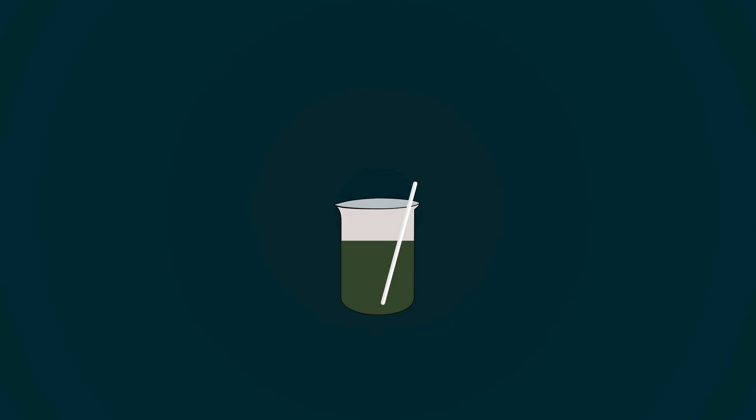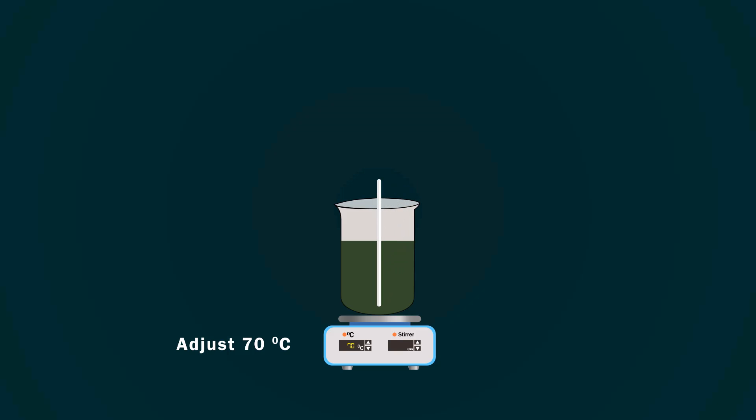Take a hot plate and adjust the appropriate temperature to warm the solution for few minutes to complete the reaction. Again, mix it with the help of spatula.